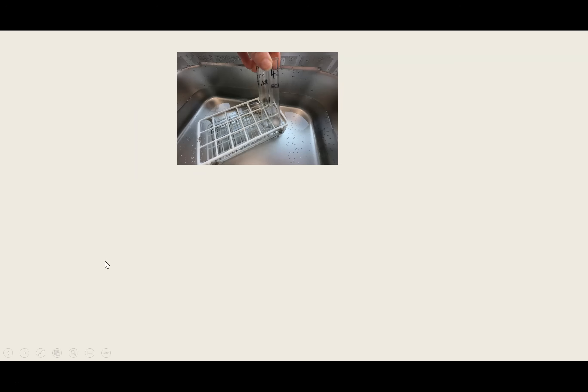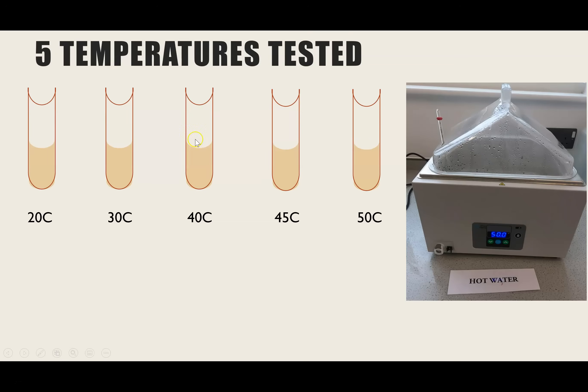Before starting the experiment, I'm going to get two test tubes - one to have a solution of the sugar and yeast, and then a separate solution for the TTC. Place that in the water bath for a minimum of five minutes. When the five minutes is up, I'm going to come back with a thermometer and check the temperature of the two solutions to make sure that they have now reached the temperature of the water bath.